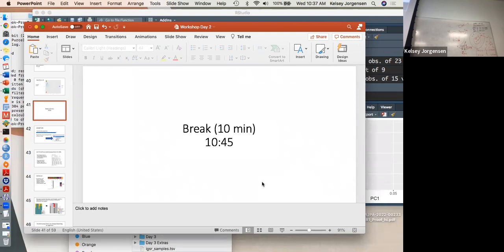Okay, so let me just do that real quick. So I add txt to force it to do that tab delimited. But since you have Windows, it very nicely opens for you. So I'm very jealous. So then I just add all these.